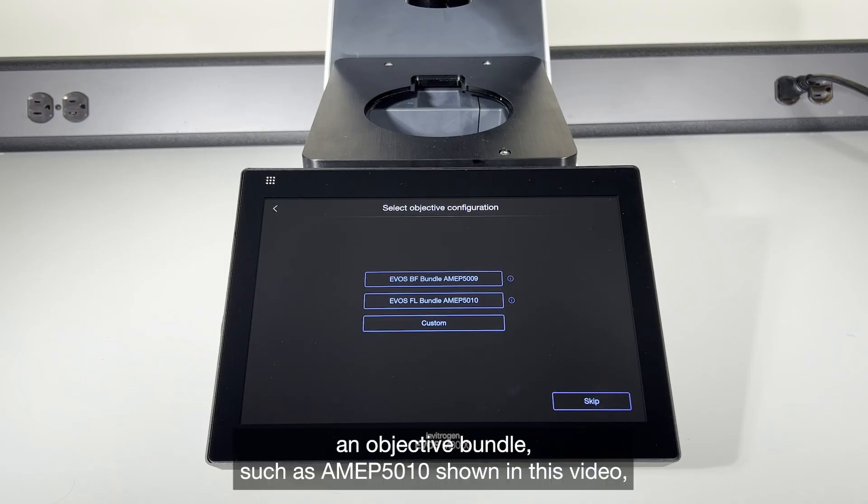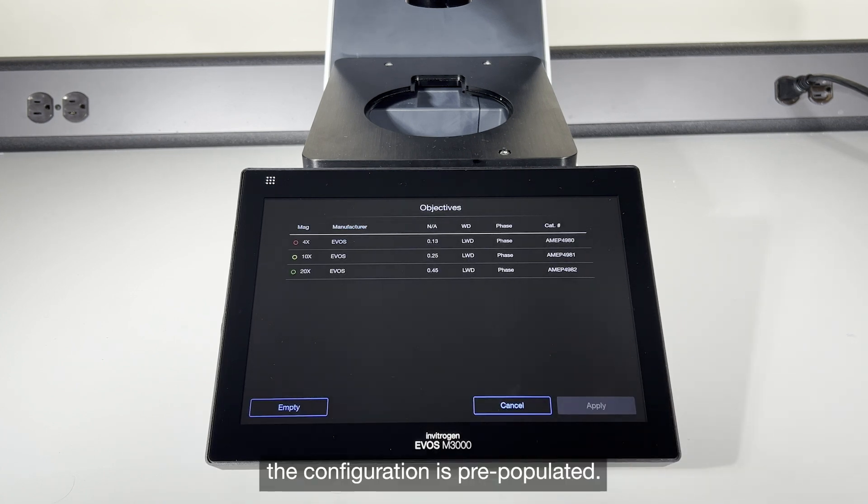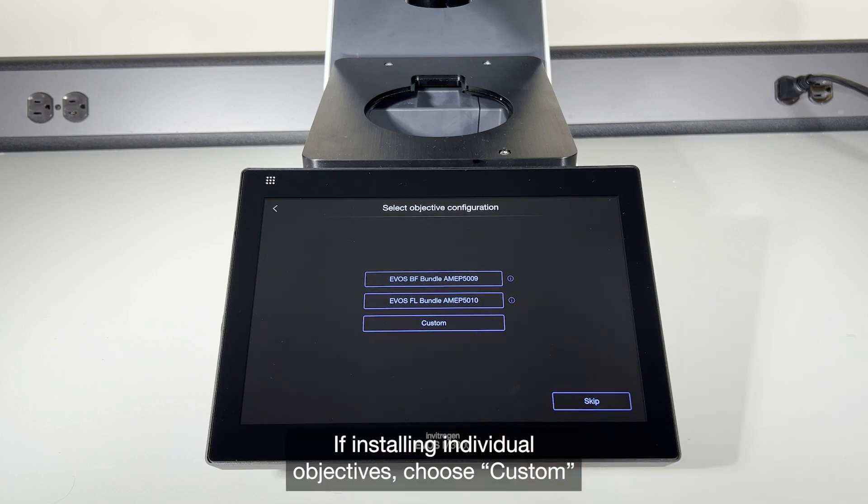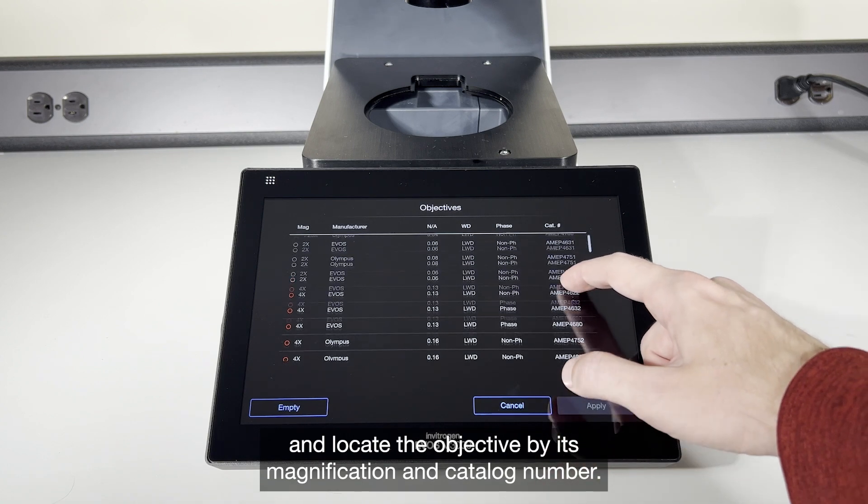If installing an objective bundle such as AMEP 5010 shown in this video, the configuration is pre-populated. If installing individual objectives, choose custom and locate the objective by its magnification and catalog number.